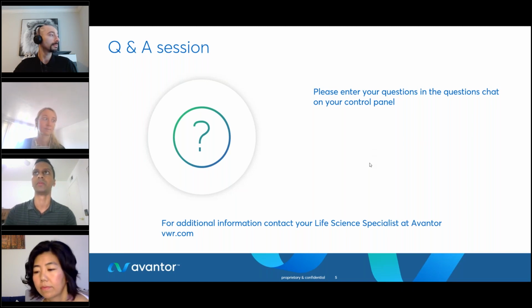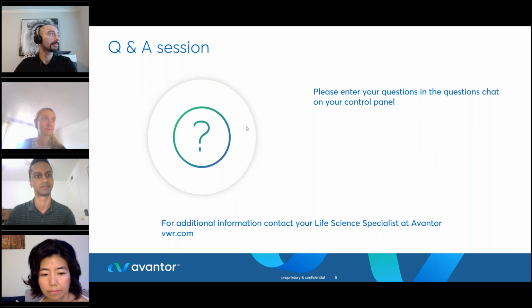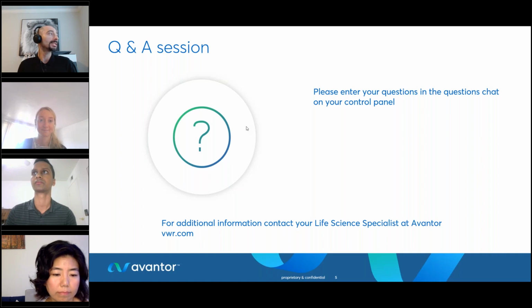In general, I wouldn't recommend deviating from our input recommendations for the protocol, and just go with the input recommendations as described in the protocol. And if you need a larger number of reads for your analysis, I would just sequence for longer, have the sequencing experiment run for longer.